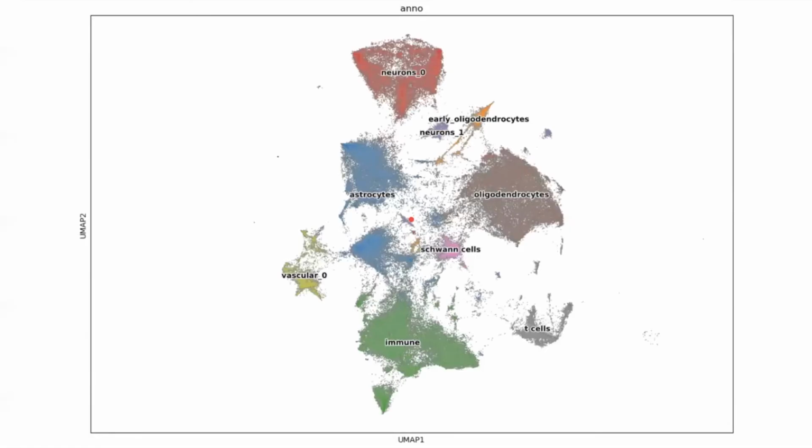And then we can actually use programs such as ScanPy to do some dimensionality reduction, in this case a UMAP, and then we can cluster later on. As you can see, it's not as clean as a single cell data set would be, right? So there's some more mixing happening here, but to some extent it's very clean.